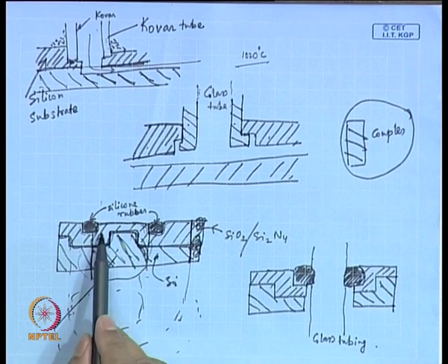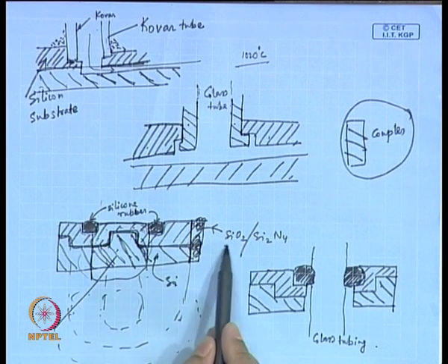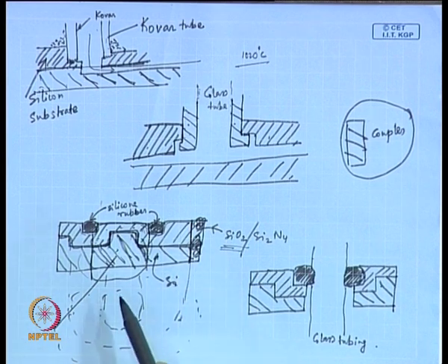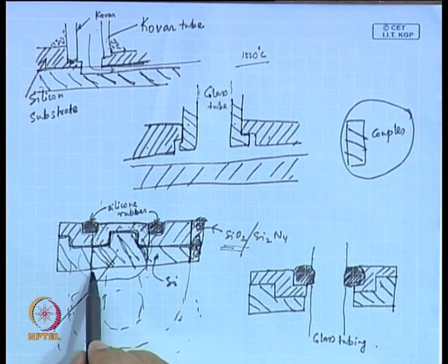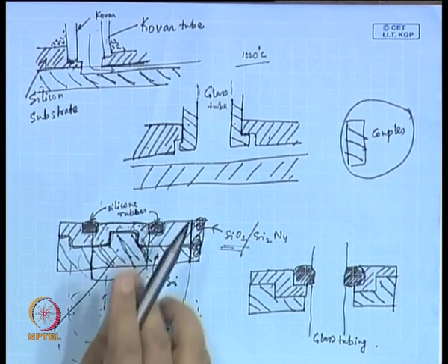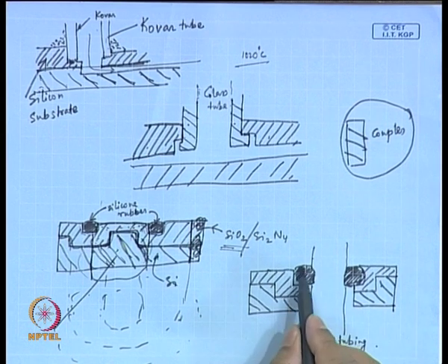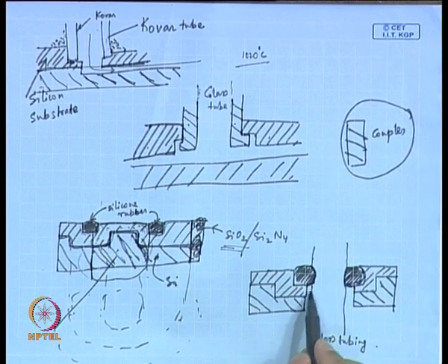And then when you try to etch this layer, it would be difficult to etch. This we pointed out, because SiO2 acts as a mask, it is much more difficult to etch the SiO2 layer. So, for this you have to bring in the plasma. So, you get this part also etched out. So, once you take this whole layer out, then what you end up with is a structure something similar to this, where the glass tubing runs like this, and this silicone rubber that you put there is acting as the seal, you see.